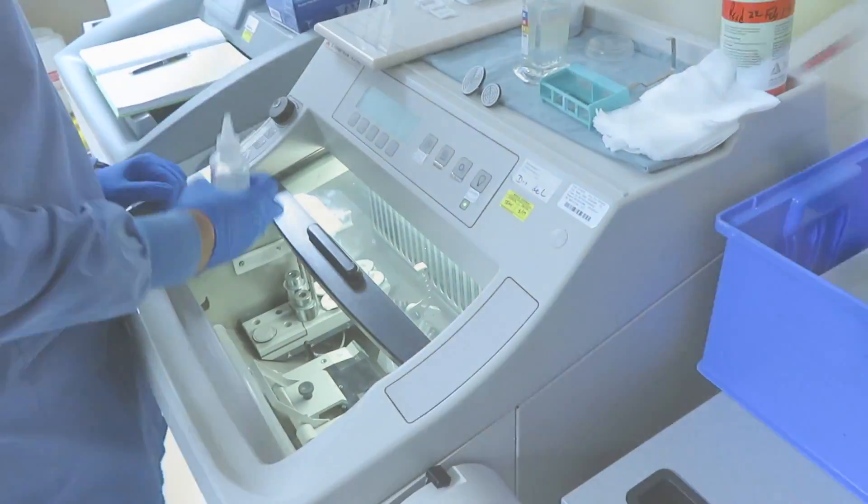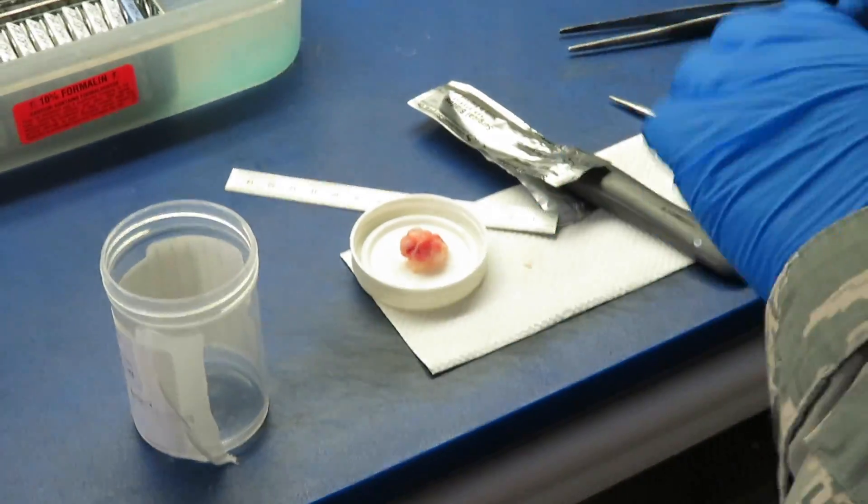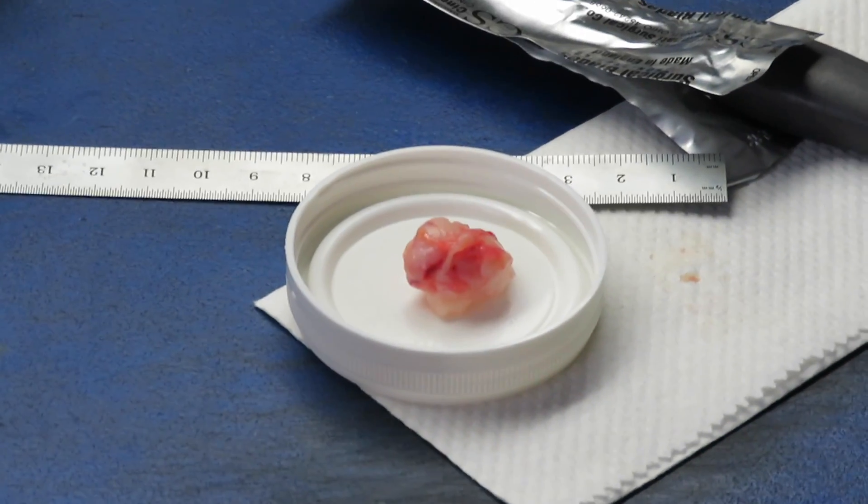Today we're actually doing a case — there's a mass that we're getting. This is a cryostat machine, where we actually do the cutting. We freeze it. We first measure it and get a representative piece.